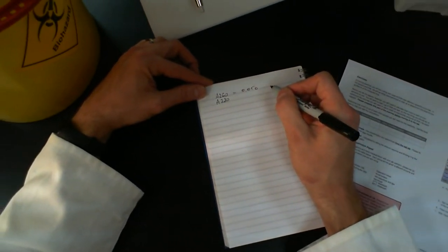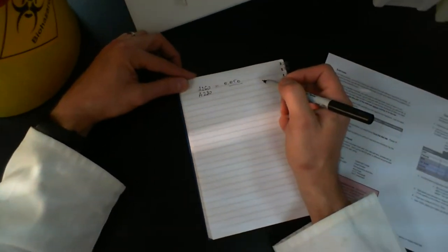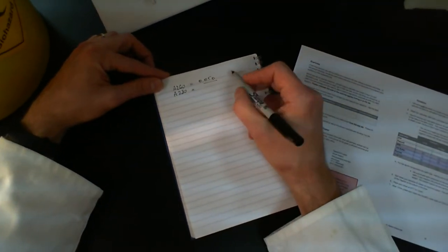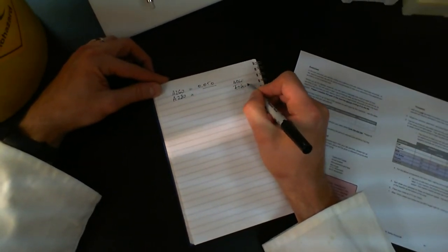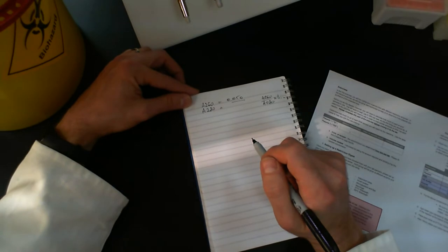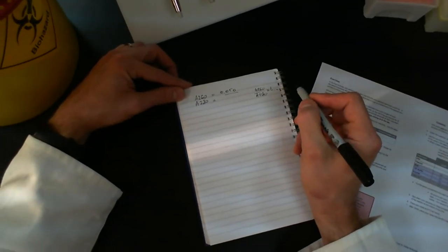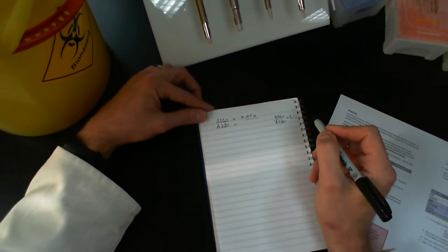Chances are you had some numbers, maybe an absorbance of 0.050 as your A260. I'm just using this number because it's nice and round, easy to work with. You had whatever number you had, and there was a number for 280 that was probably a little bit lower. Hopefully your A260 over A280 was 1 point something, close to 1.8, but I don't think anybody got close to that, probably about 1.3, 1.2. That tells you your DNA is not pure, which we're not expecting. The DNA prep, the mini prep, is a pretty quick and dirty method. It's not going to give you pure DNA.